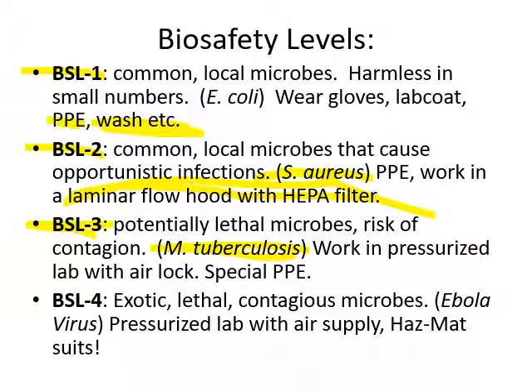In this case, you have to work in a special room that has a special negative air pressure, which means that if you have a room, some of the bacteria, if they're airborne, if the bacteria is released into the air, is that room airtight or not? The odds are that if it's a standard room, it's not going to be airtight. But there's a way around that. You don't want the bacteria to leak out of the room into the environment. If you have negative air pressure inside the lab, that means yes, it's not airtight and air will leak, but if air is going to leak, it's going to leak into the lab instead of out of the lab.